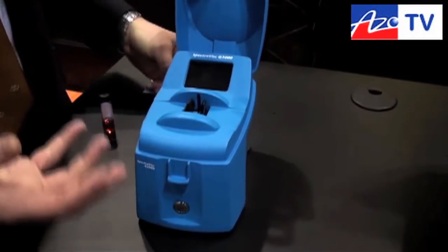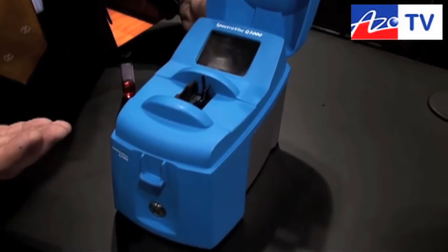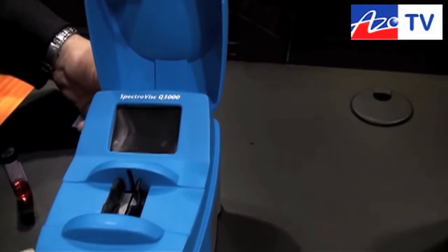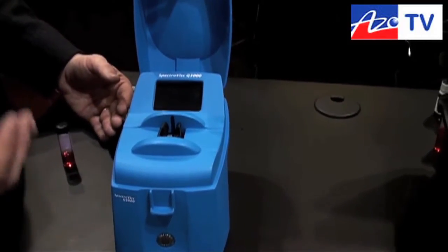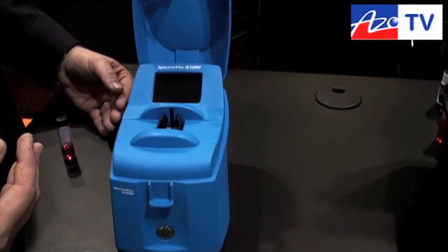One of the things we often get asked is: who needs a portable viscometer? A lot of times people need to have an immediate viscosity check for their critical equipment when they need answers straight away. One of the biggest challenges is getting good, reliable kinematic viscosity easily in a solvent-free mode with very little sample available.